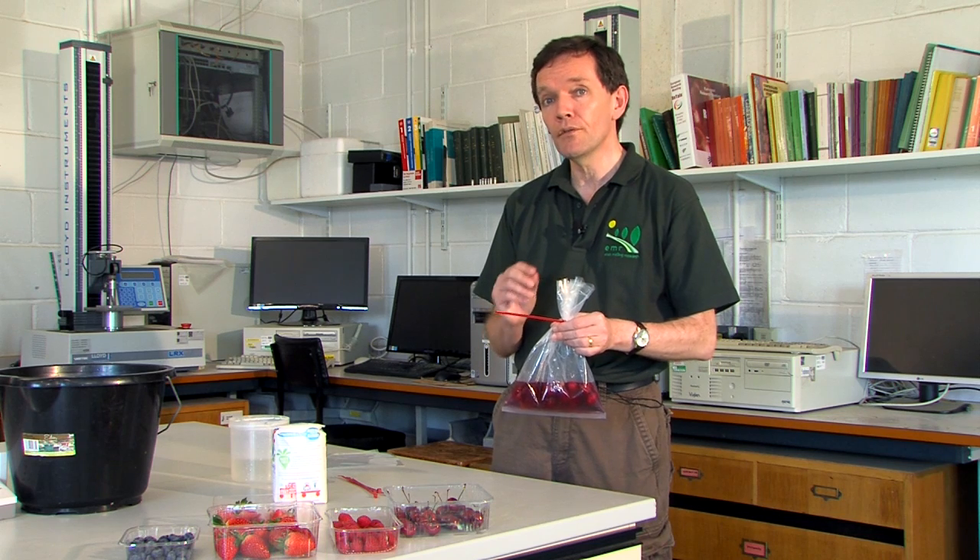What you're looking for are fine white lines between one and four millimeters long that show up quite well against a dark solution like this. After 20 minutes they should still be moving, which makes them easier to see.